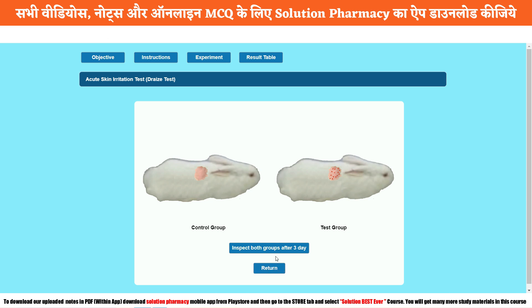Now let's inspect both groups after three days. Click on 'Inspect Both Groups After Three Days.' After clicking this tab, you will find a slight but major difference — there is an increase in inflammation and increase in irritation on the test group rabbit. But in the case of the control group, there are no changes because it did not receive any kind of medicine — just an empty patch was applied over the skin, so there is no irritative substance.